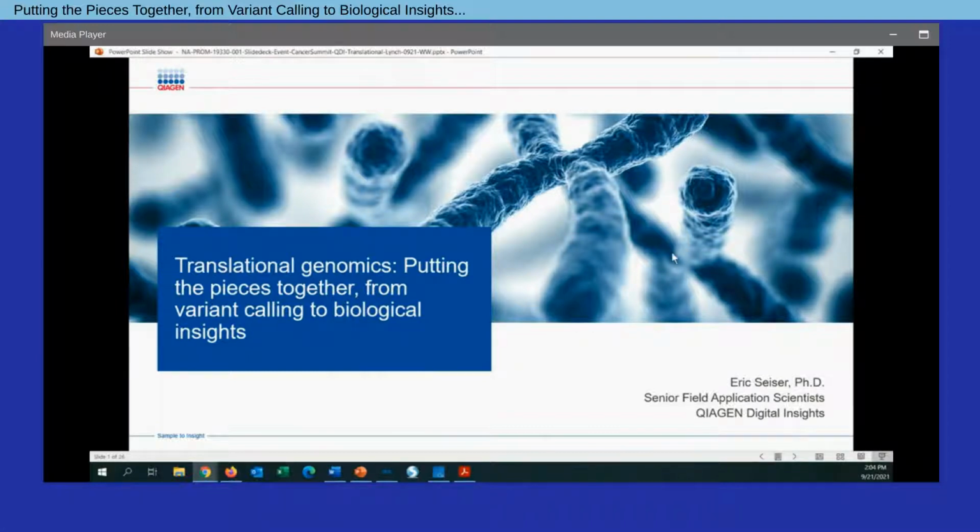Good afternoon, everybody. As Andrew mentioned, my goal today is to demonstrate how we can move from a scenario where we're starting off with FASTQ files from sequencing. We're going to call variants, filter and prioritize variants, and then define some biological interpretations from specifically loss of function variants in a cohort of samples.